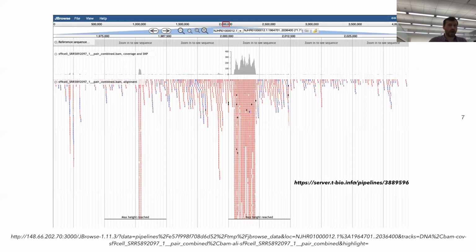Now, once you have those reads, one of the first things that you can do is align those reads onto the reference genome. So this is an example of a file like this with FASTQ aligned to some reference genome. And what you can see here is abundance of reads, right? So here you have a lot of reads aligning to this region.